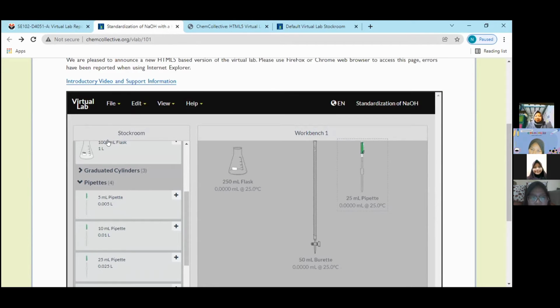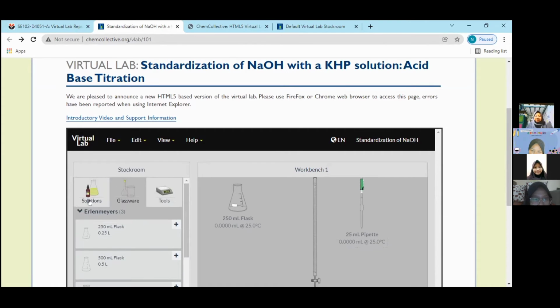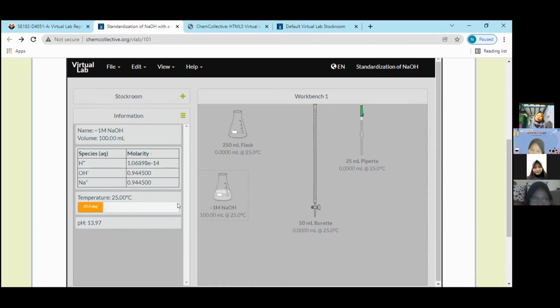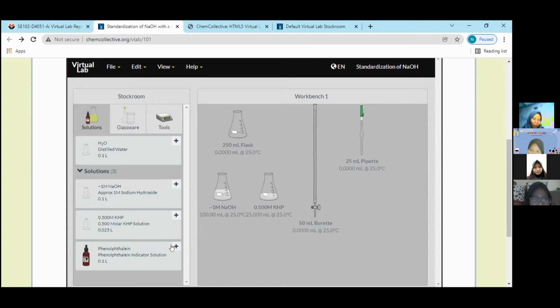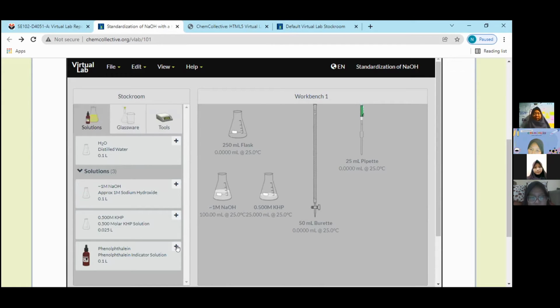That is for the apparatus. Now we move to the materials. The materials for this virtual lab are 100 milliliters of NaOH, 25 milliliters of KHP, and phenolphthalein. So that is for the materials. Please, Fani.